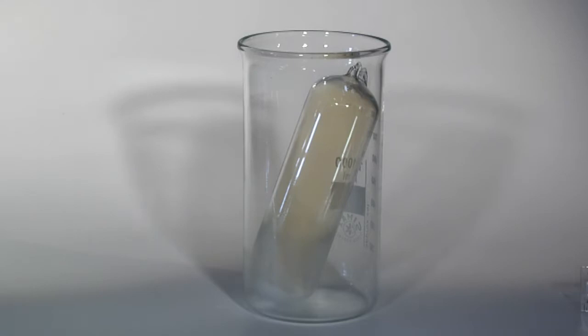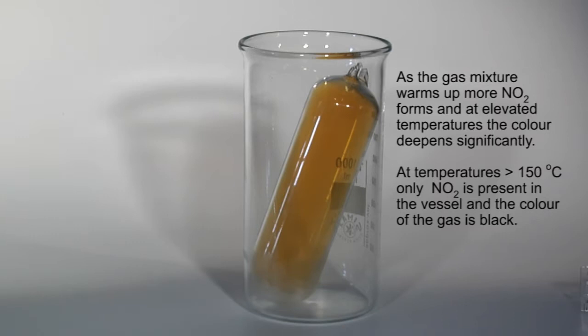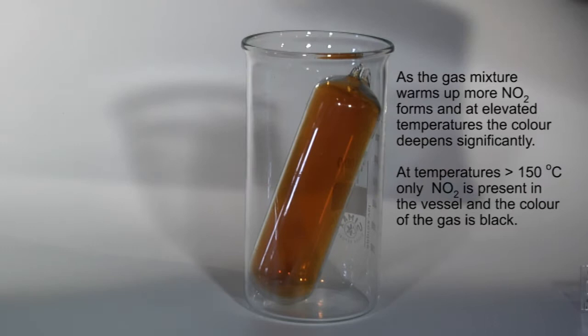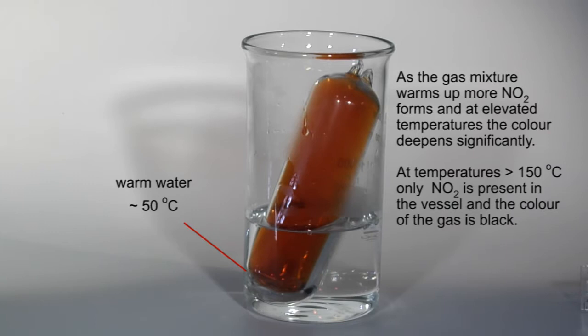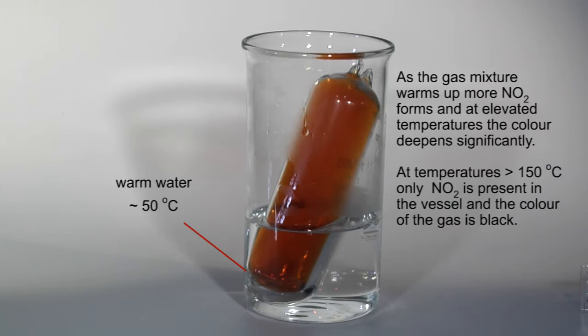The mixture needs to be heated to temperatures in excess of 150 degrees Celsius in order to shift the equilibrium to the extent where effectively only nitrogen dioxide remains. The gas would then appear almost black. To do this in this thin-walled glass vessel would, however, be hazardous.